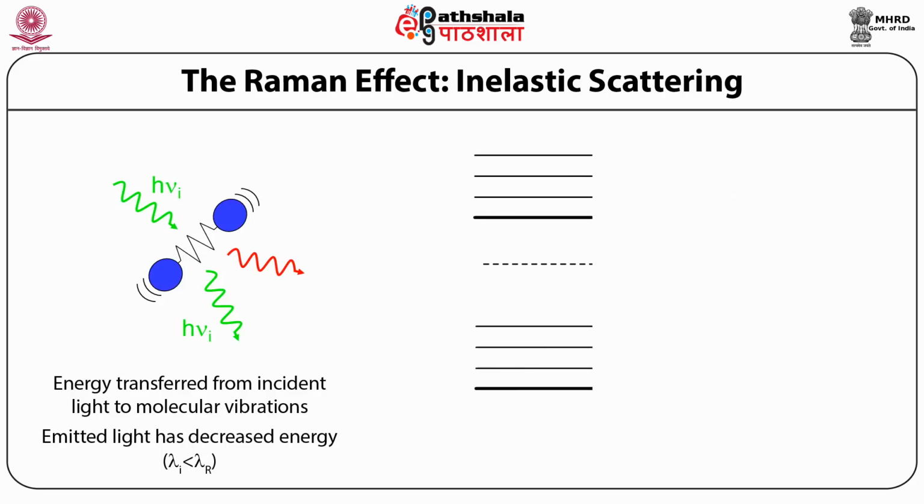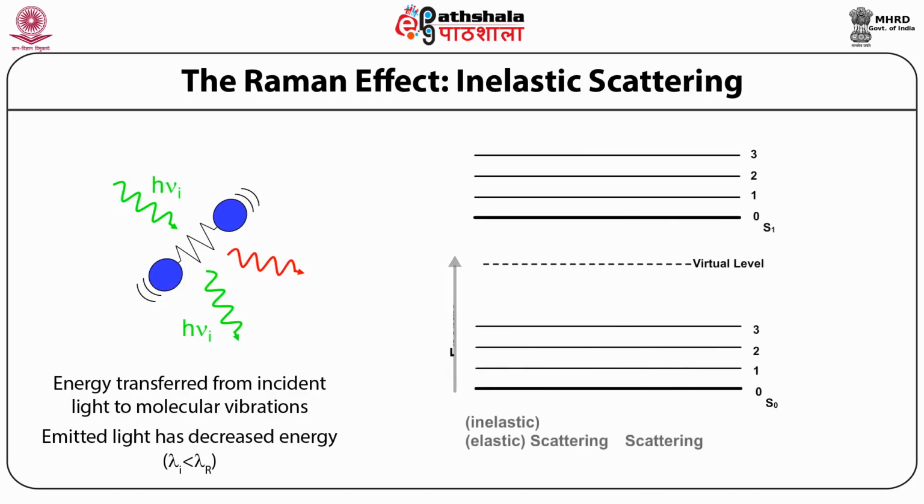The process which leads to inelastic scatter is termed the Raman effect. Change in rotational, vibrational or electronic energy of a molecule can cause Raman scattering. Oppositely, if the scattering is elastic, the process is also known as Rayleigh scattering.